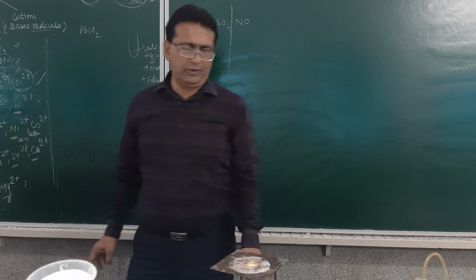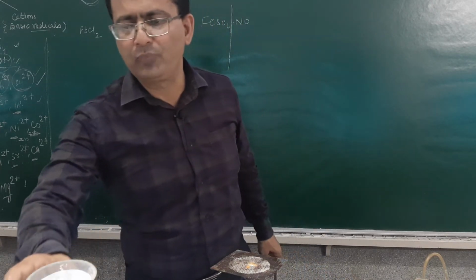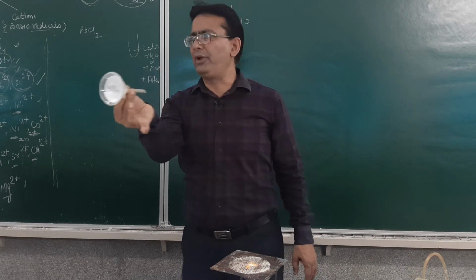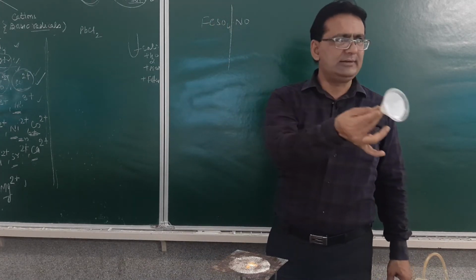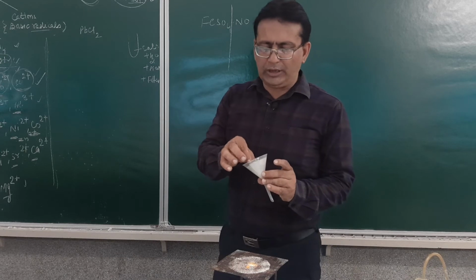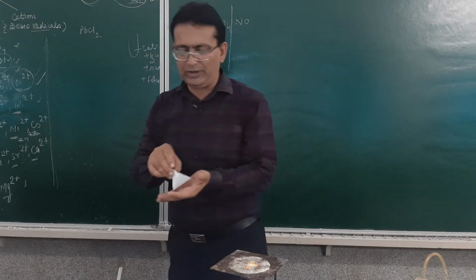The important thing is, how do you collect the residue? Now, see very carefully. You must observe whether it has got filtered or not. You may see over here, a residue is observed. Yes or not? White color residue. In this residue, we'll be carrying out a test of lead ion. So I need to collect this residue first of all. I'll take this out.